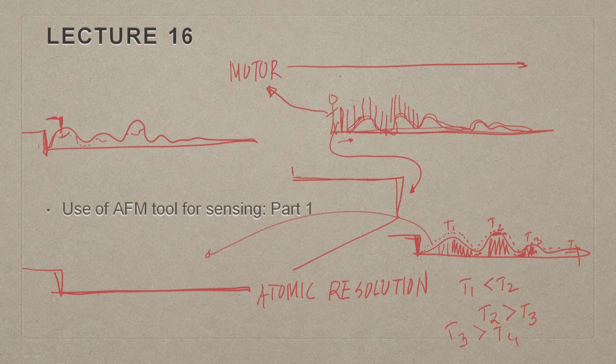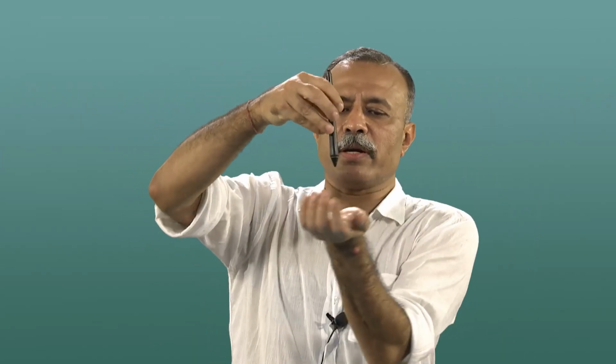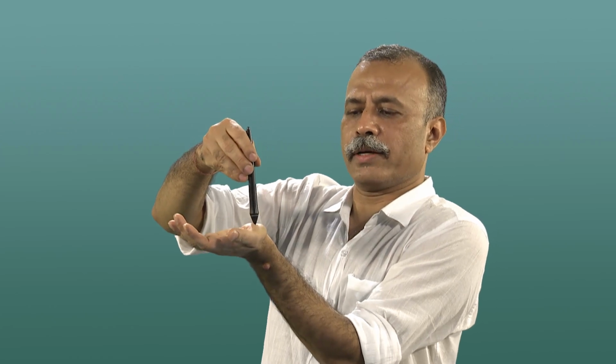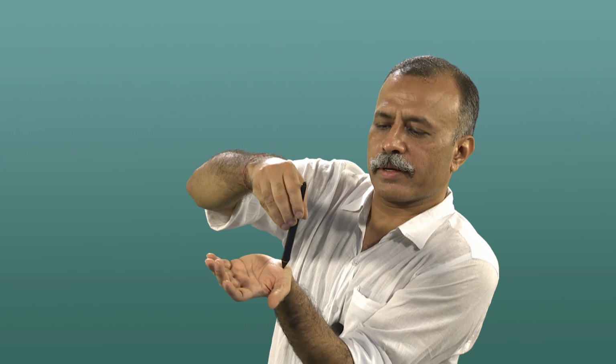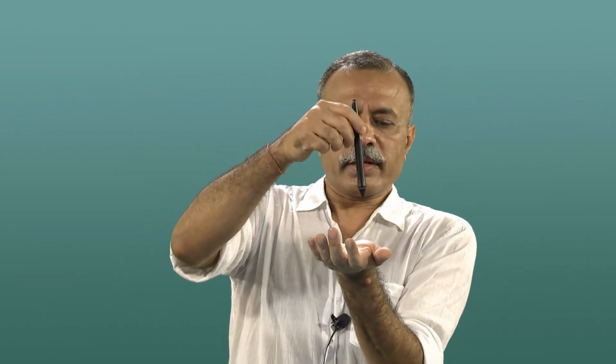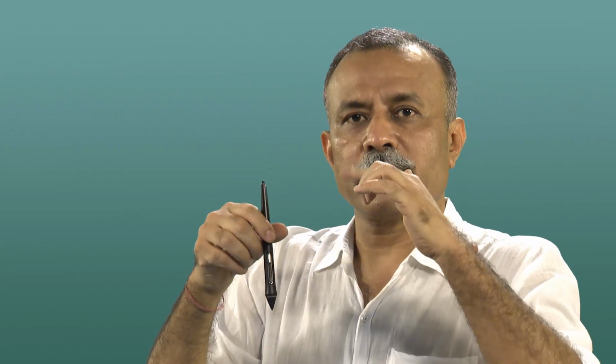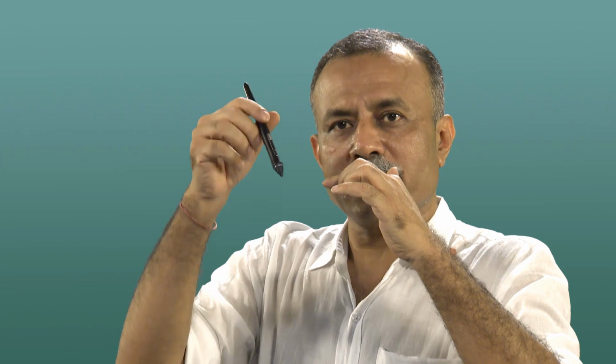But then when it is doing so, there are two kinds of information which it could gather. One, and I am not getting into how you are gathering information, I will come to that later. One, when you are hitting, the probe is hitting a surface like this. Say for example, this part, this in my palm. So my palm collapses, right? It will collapse. You could see that. There is a dent which is happening, right? Now, whenever such a dent is happening, the tip experiences a vibration. It will start to vibrate like this because it is hitting a surface when it is touching.